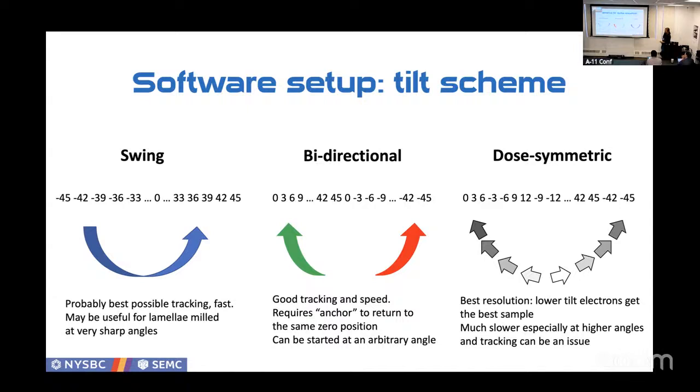So you're imaging the thinnest possible ice, and you're getting the lowest damaged images. So you're getting, from these tilts, the highest resolution, especially the first, say, 7 tilts. But it's much slower. But if you combine this with PACE, where you tilt the stage multiple times into different directions, but you can collect multiple tilt series at the same time, actually the speed becomes very, very good.